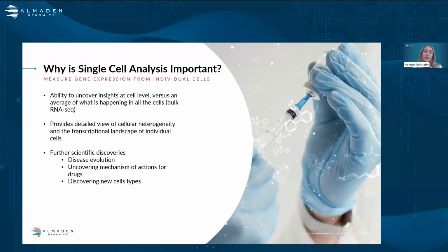And so, of course, today's webinar is focused on single cell. And I think it's important we touch on why this type of analysis is so important. And before I jump into some of the reasons why single cell is so important, I'd like to host a poll and see how many of you are actually working with single cell data right now. So in just a second, you should see a poll pop up.